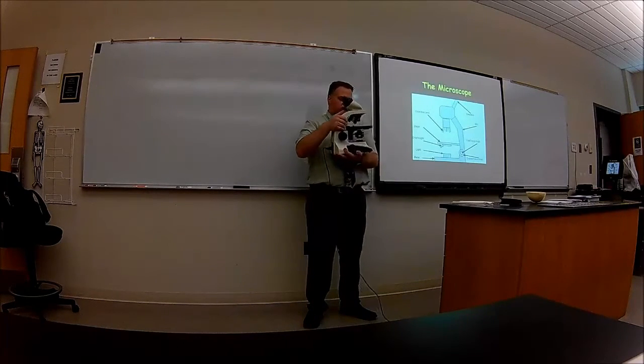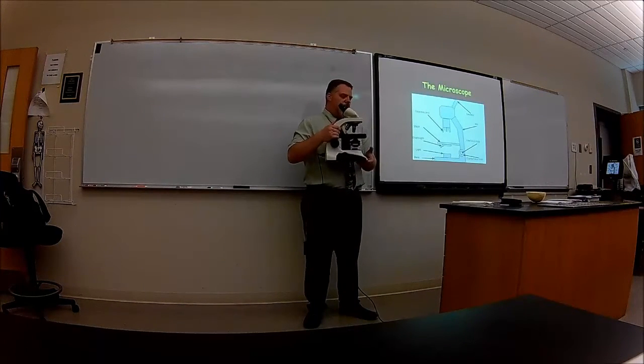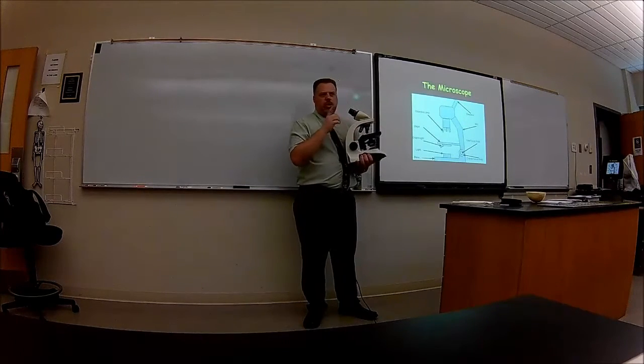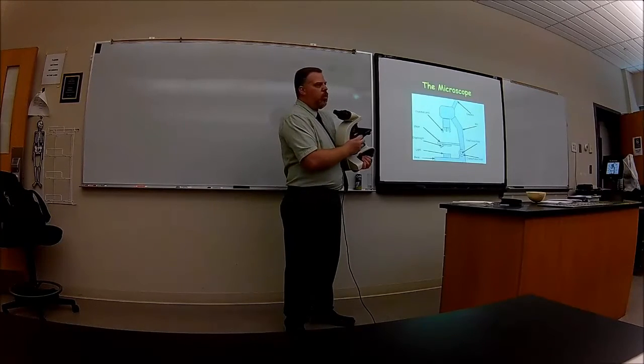Then you're going to have this area called the stage. The stage is where you're going to put your slide on. When you get closer to it you'll see with a little video how to put the slide on — there's a little lever.